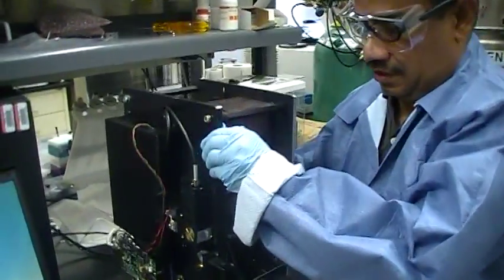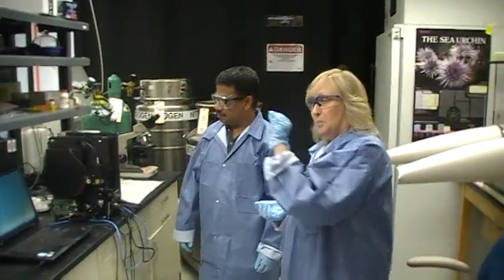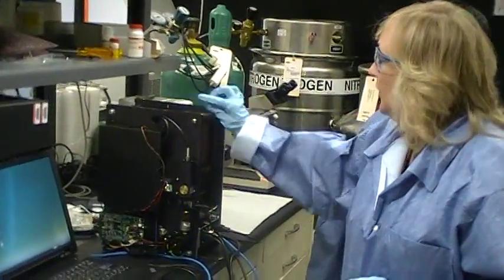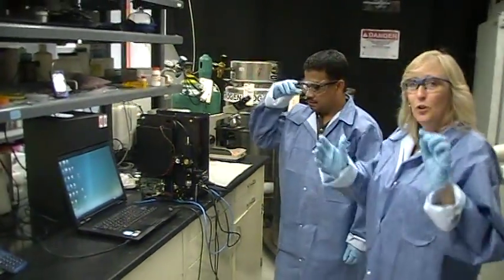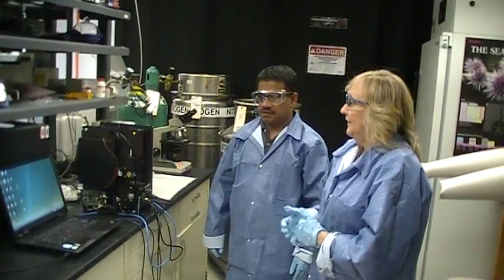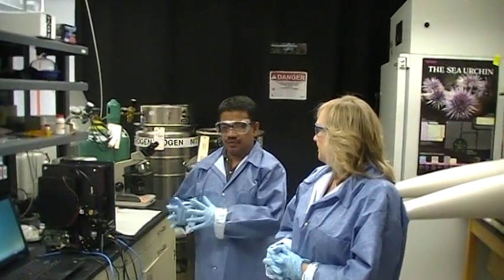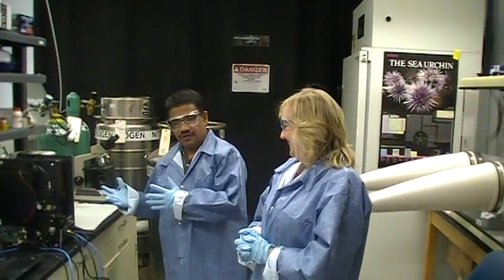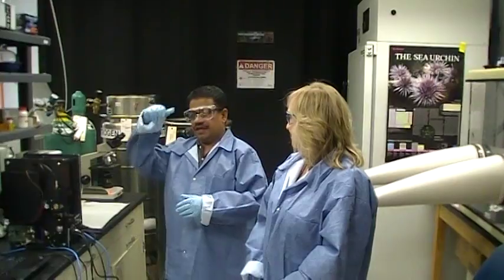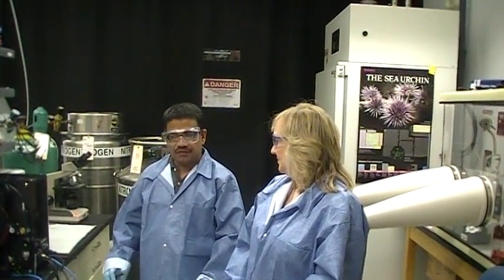Even I can lift it — it's not heavy. On the first instrument, the laser is going round and back and forth. Here, the only path is between the laser and the machine, because fiber optics is taking over all of that sensitivity that the laser was doing on the other side. A non-technical person can do all the job that needs to be done. It is not very sensitive to environmental changes like temperature, humidity, or light conditions as does the other instrument. It's a very compact, lightweight instrument.